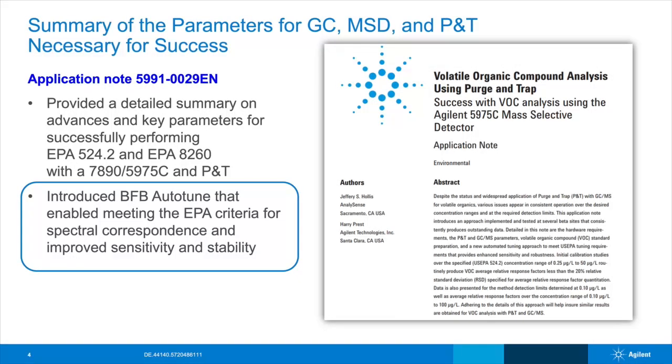Now, I'm going to be referring to two application notes today, and I would suggest that you look at these if you're going to be using a system like this and setting it up, especially for the first time.